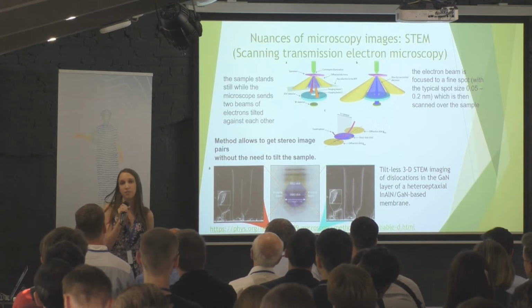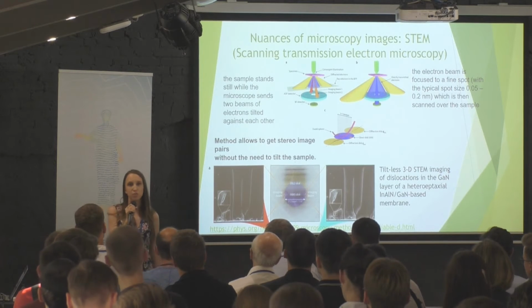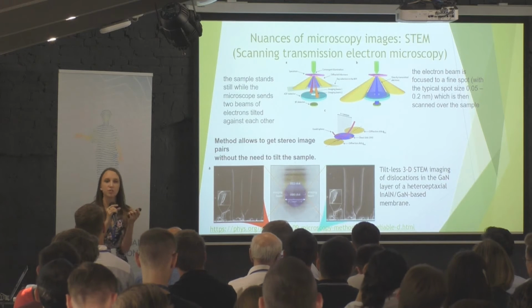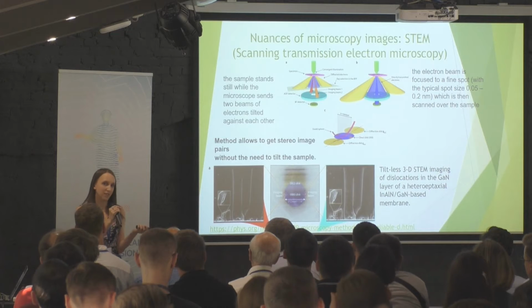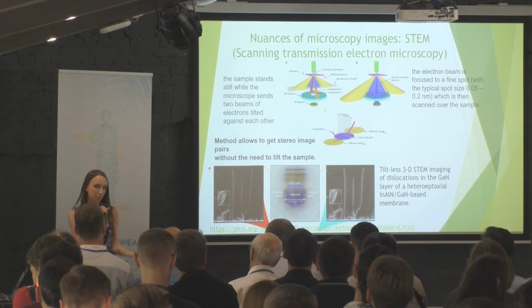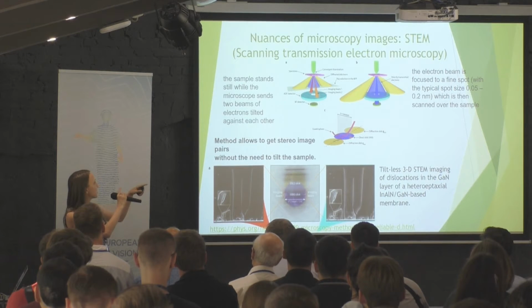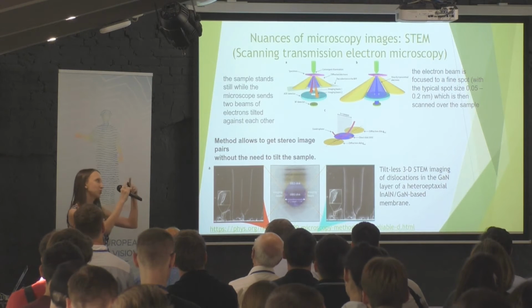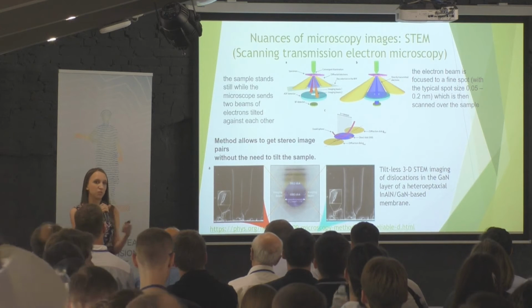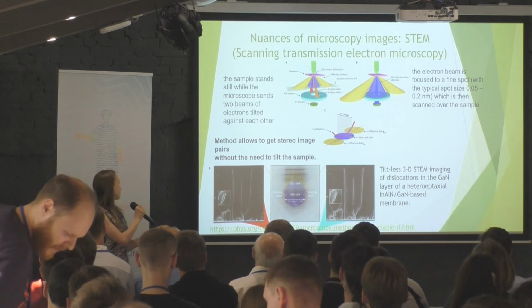So here in EPFL, there was another technique where you don't need to tilt the sample. What's done? You have an electron beam that is going through the specimen. It's a really, really super thin piece of metal, and the scales are hundreds of nanometers. The electron beam goes through the specimen and gets converted into 2 beams. That's the way you can think of 2 cameras that are looking at the specimen from 2 different angles. And this angle will determine our range of disparities.